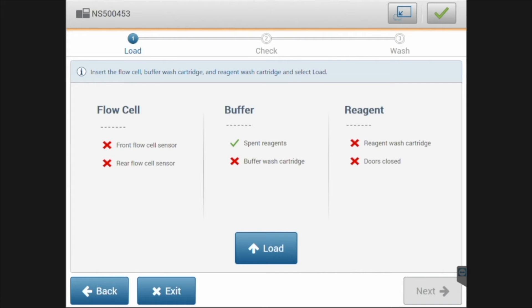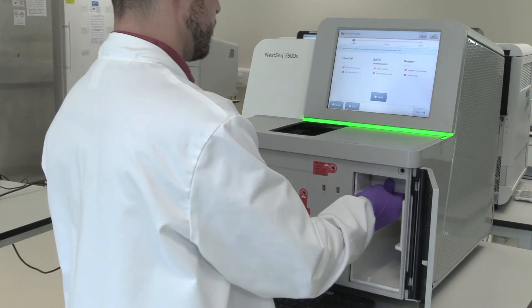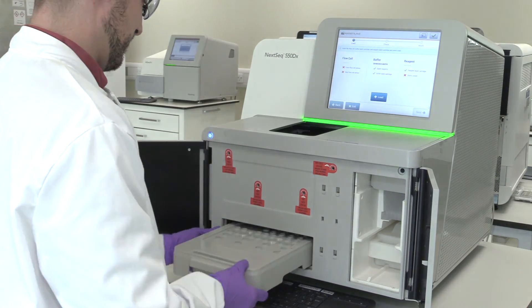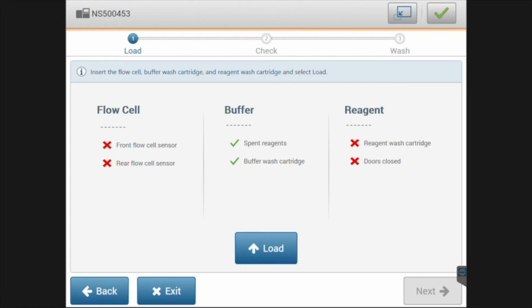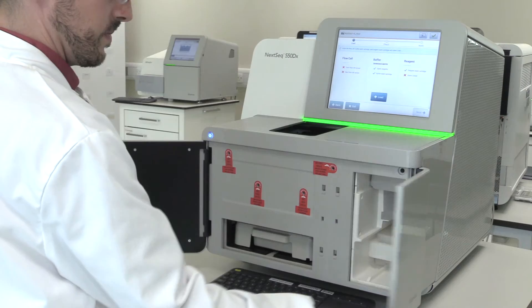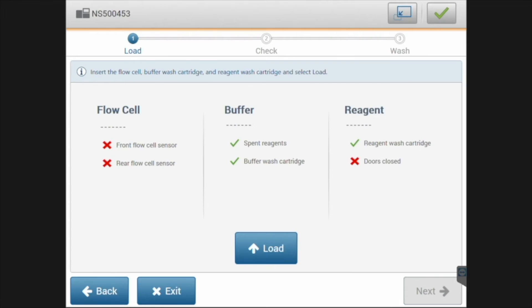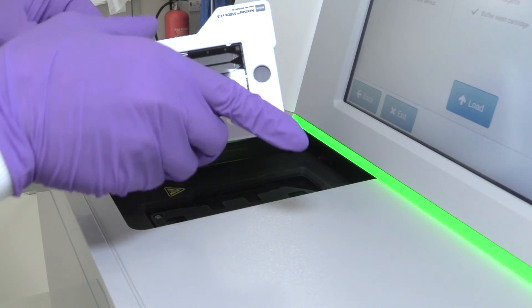Once selected, please load up the wash buffer cartridge, the wash reagent cartridge with the loaded reagents, and the spent reagent cartridge, then close the door. Then please load an old flow cell used in a run that worked previously and press the load button.